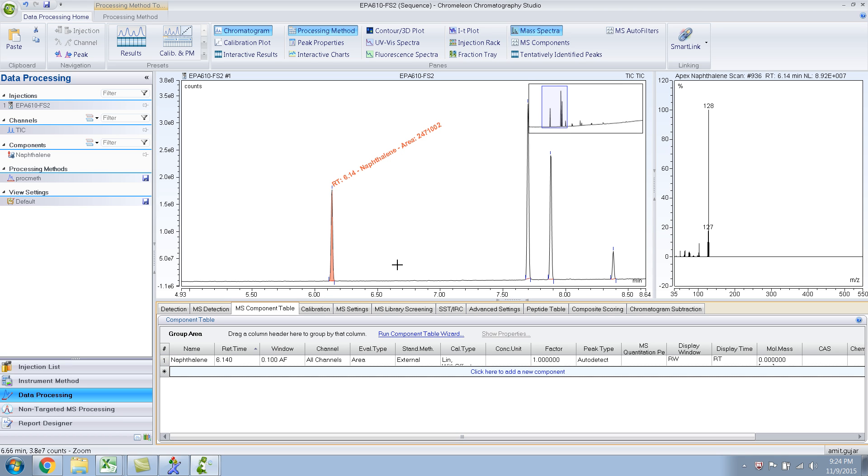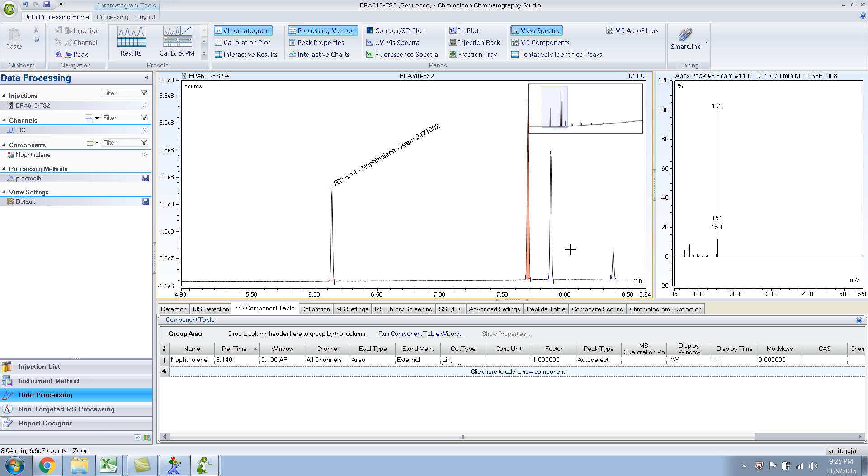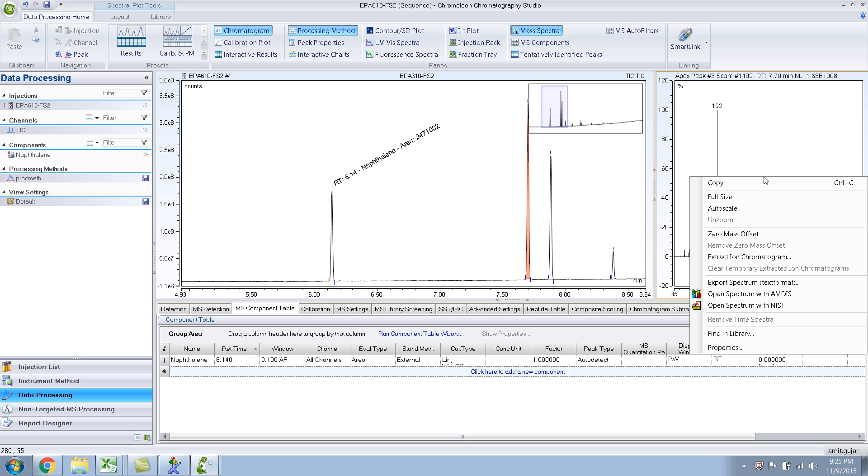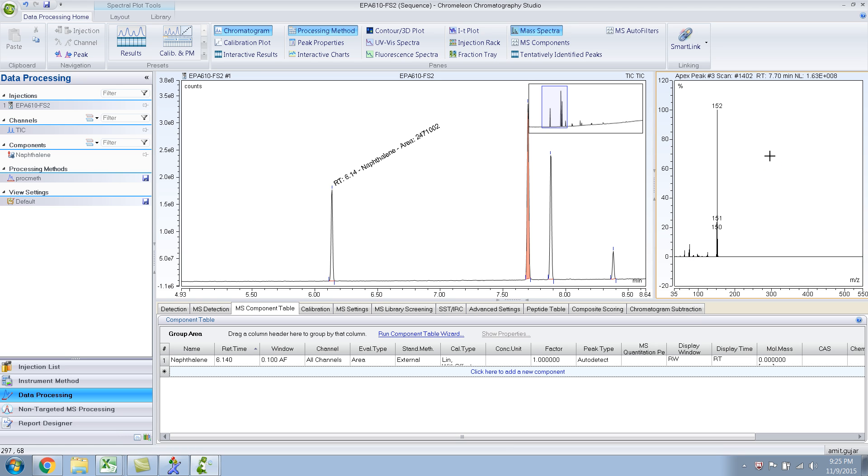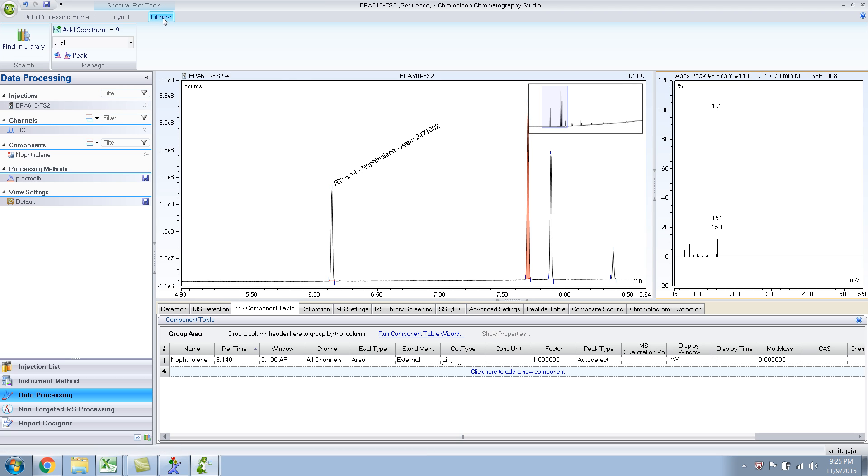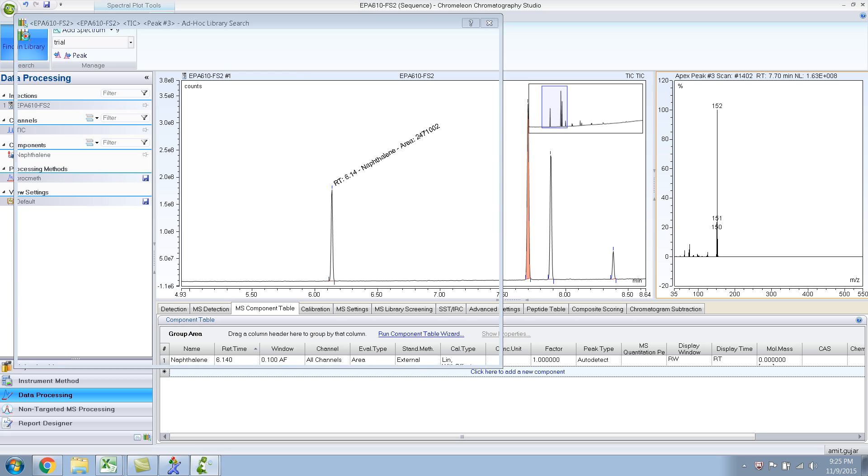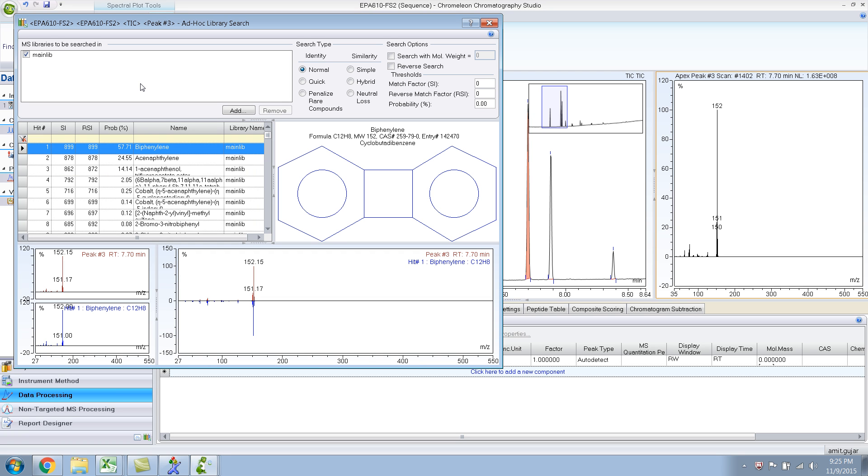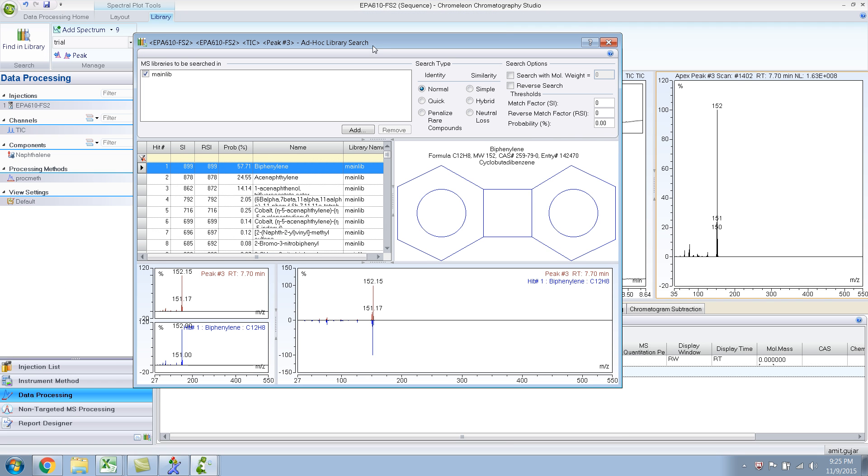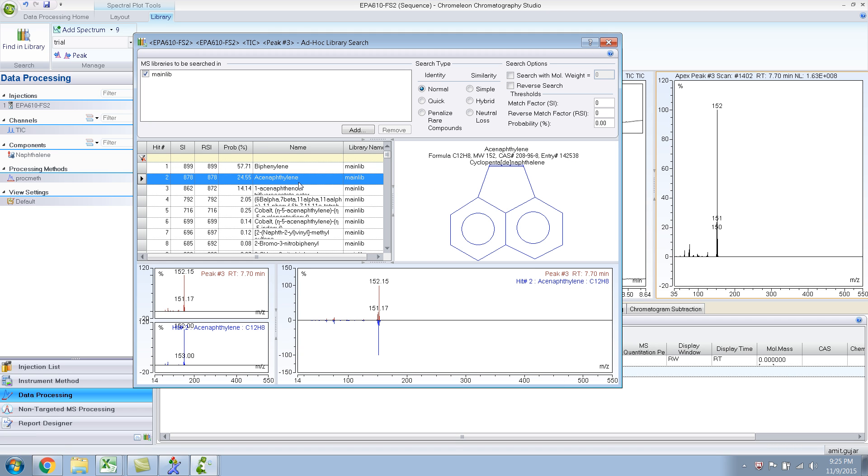So similarly, you can do the same thing for this compound. Right click, library search. Let me show you another way of doing library search. So when you are in the mass spectra pane, you go to library and find a library. It's the same thing, but I find right clicking and going to the library search much easier. And this particular compound is acenaphthylene. I know it because I know what compounds were there in the mix.